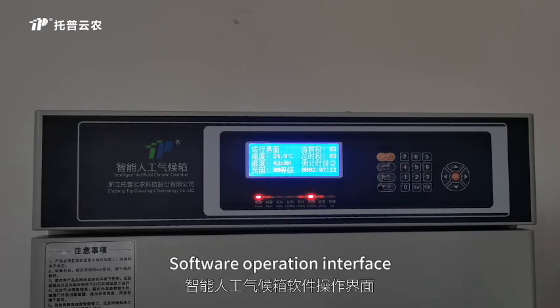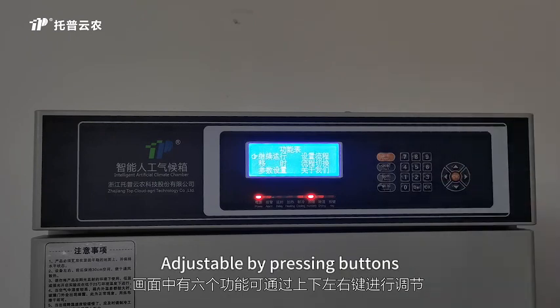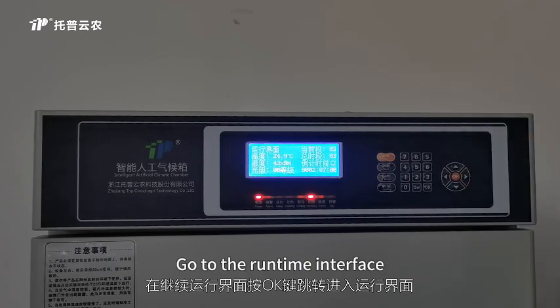Software Operation Interface. There are 6 functions, adjustable by pressing buttons. To continue operation, press OK to jump. Go to the runtime interface.